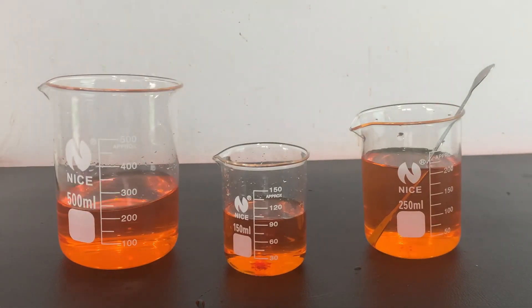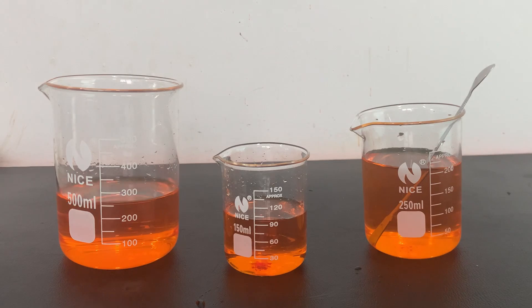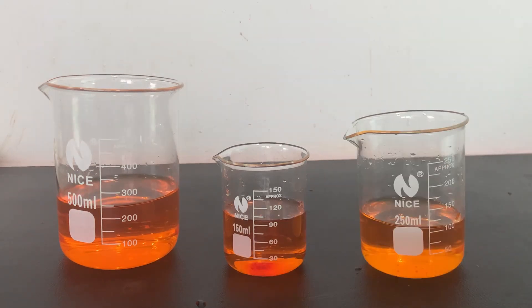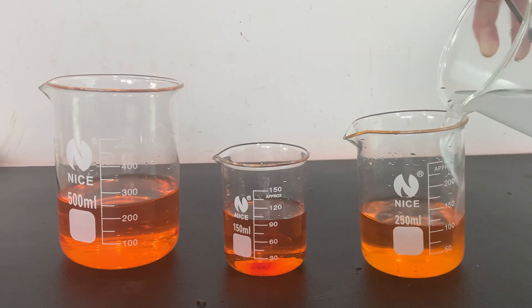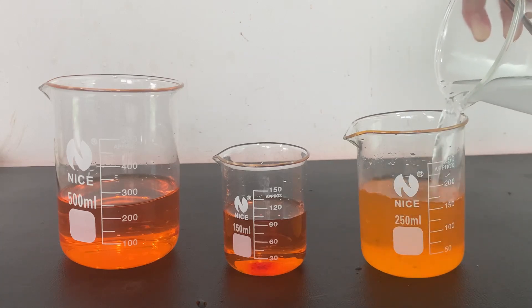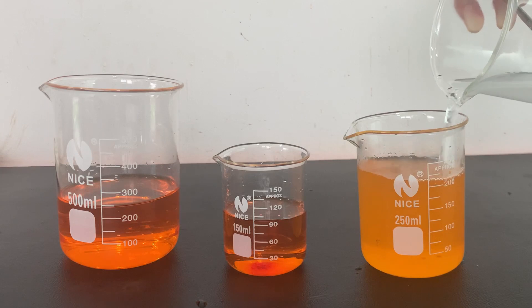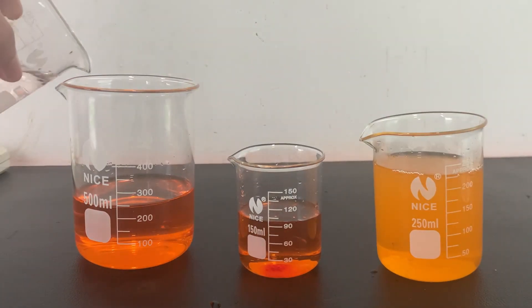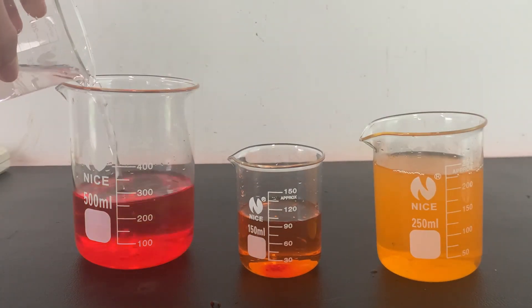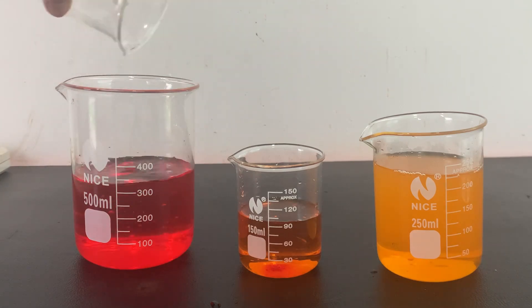To test the methyl orange as a pH indicator, I made solutions of it in three different beakers. To the right beaker, I added a sodium hydroxide solution which caused the color to turn yellow. To the left beaker, I added hydrochloric acid which caused the color of the solution to turn red.